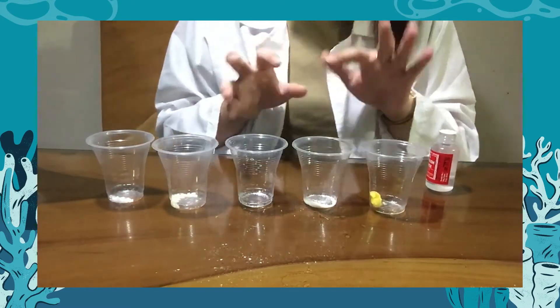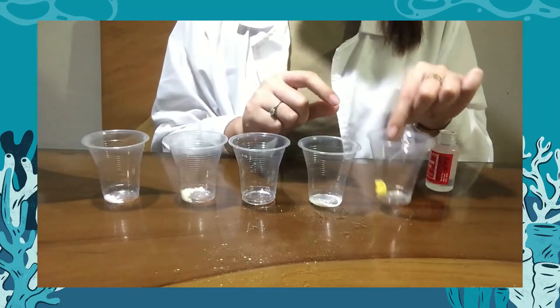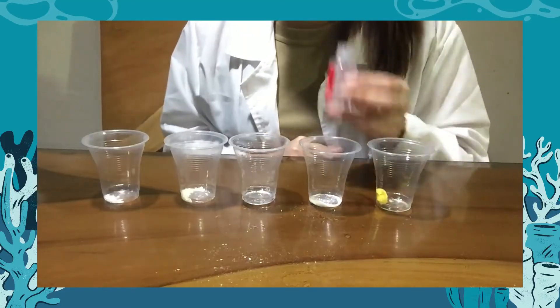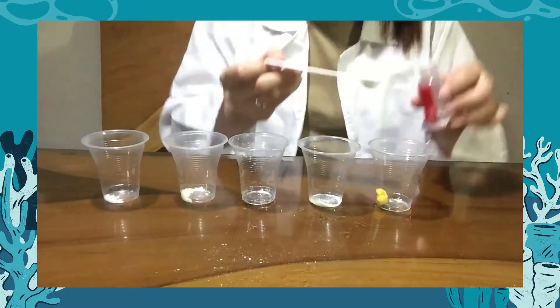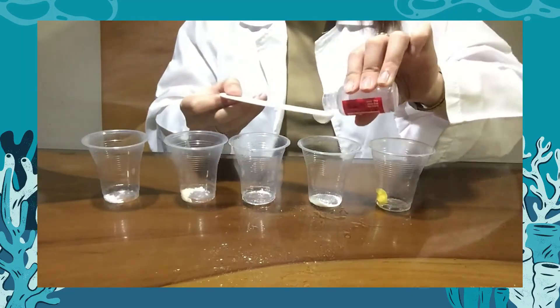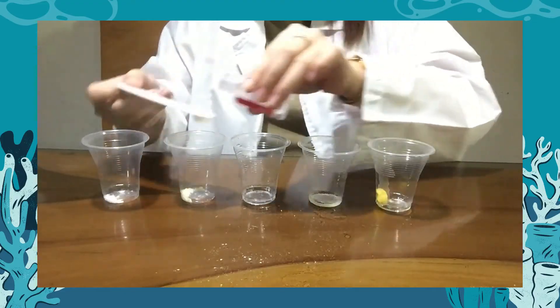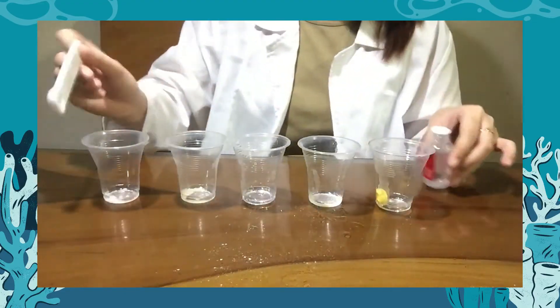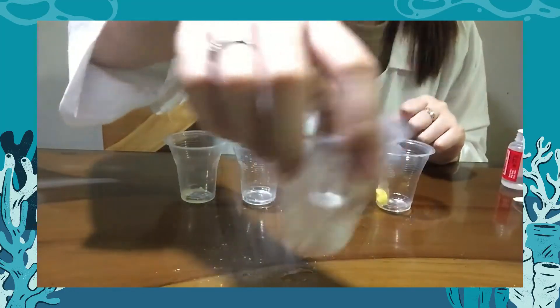Now let's repeat the process, but this time we'll use acetone instead of water. Each plastic cup contains the same substances as before. Let's put 1 ml of acetone into each plastic cup and shake it vigorously for the substance to be dissolved.